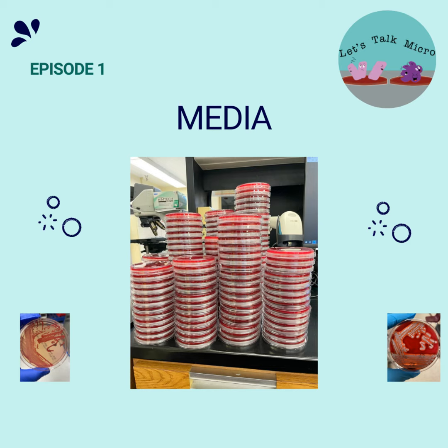Neisseria do not grow on it. Anaerobes do not grow on it. Haemophilus does not grow on it. Pasteurella doesn't grow on it, with the exception of Aerogenes. So not all gram-negative rods grow on it either. So it is selective for gram-negative rods, and then it's differential for lactose fermentation.